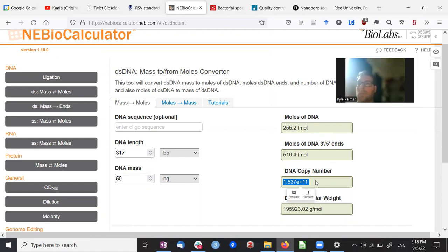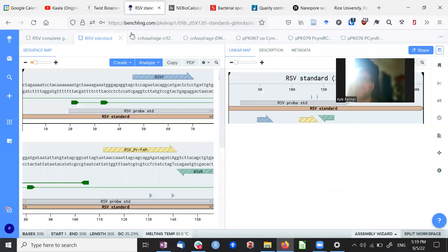So when we do ddPCR, if you remember our calculation, we need a maximum of 5,000 copies. That would be 5,000 for the 10 microliters that goes in. So according to that, you need 500 copies per microliter. If you take the vial that we get, suspended in 200 microliters, you have to dilute it all the way from 1E11 to 500 copies. So you dilute it about 7 orders of magnitude. That's how we do the calculation of how much to dilute: we dilute 100-fold, and 100-fold again, and 100-fold again. That's the whole reasoning for this.